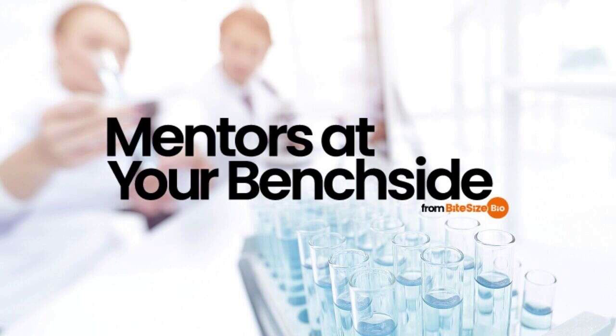Problem number 5. The stain is inconsistent or there is a space that is not staining. This indicates there is a problem with your transfer. Ensure there are no air bubbles between the membrane and the gel when setting up the sandwich. And take care when inserting the sandwich into the apparatus. Forcing the sandwich into the apparatus may cause the gel to break, the membrane to wrinkle, or allow space for an air bubble to interfere with the transfer.